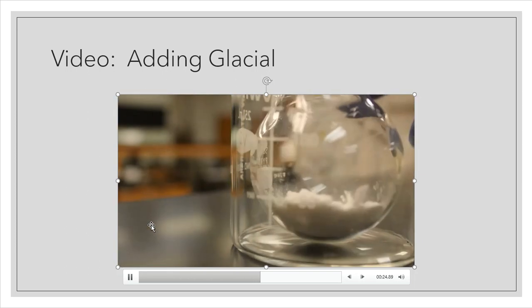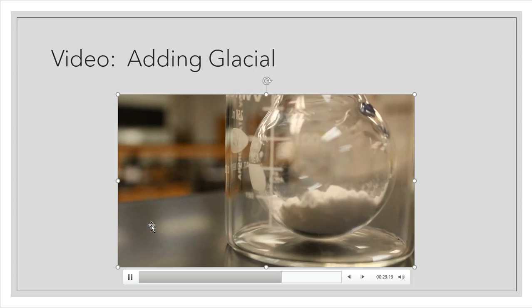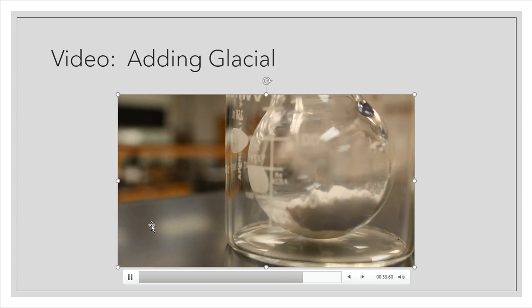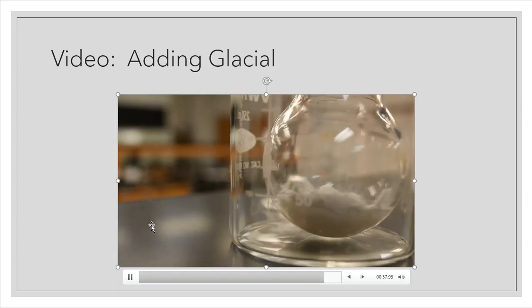So I'm getting ready to mix these two things together, and I'm going to mix them live so that way you can make your observations as you see fit. So in goes the acetic acid. All 6 mLs have been transferred.